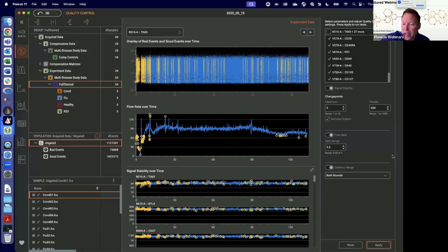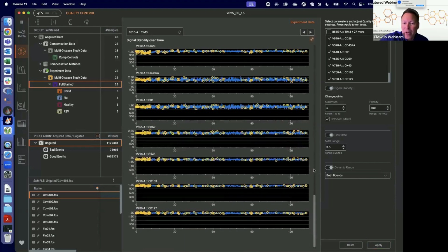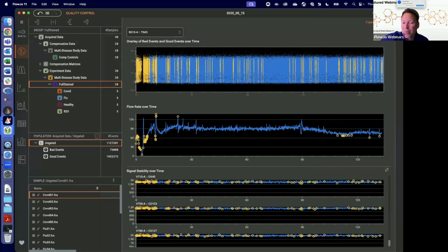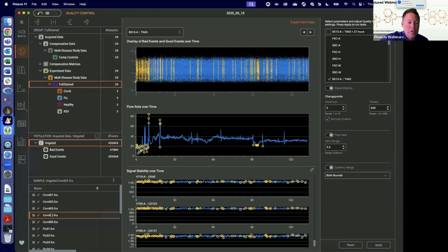Okay. And going back to our theme of the hierarchy controls everything. So I'm over here, I'm looking at a plot of the first sample here of COVID-1. I can scroll to look at the signal stability of any given parameter. I can give that particular screen advocacy over the entire middle panel. I can always make these wider, etc., by closing anything up on the side. And then I can use the hierarchy to control which sample it is I'm looking for. If I want to go directly to a specific sample, I can also just use the advance arrows to move back and forth through the data. For our initial plot here, where we're showing the overlay, it's time versus, and then you can choose your y-axis for whatever you would like to do.